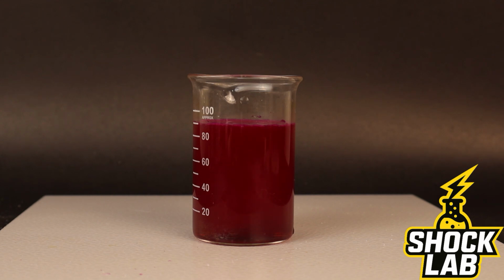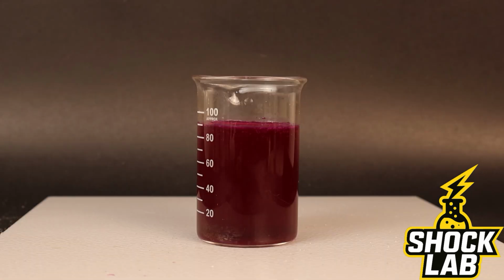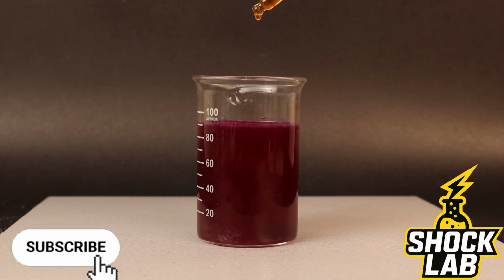Now I add a small piece of calcium carbide. As soon as it comes into contact with water, a chemical reaction begins. Calcium carbide reacts with water to produce acetylene gas and calcium hydroxide. The calcium hydroxide makes the solution alkaline.